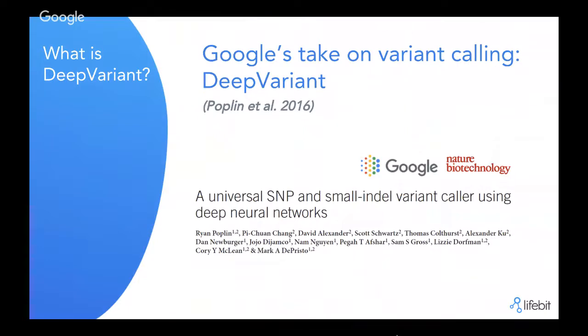It has been shown that after training DeepVariant models on such large data sets, like Genome in a Bottle, for example, the model can be extended. That model can be reused, not just for one reference genome, which can be HG19, for example, the human reference assembly, but that exact model can also be used on newer versions of the human genome, like the latest versions. And it achieves quite a high accuracy in this case.